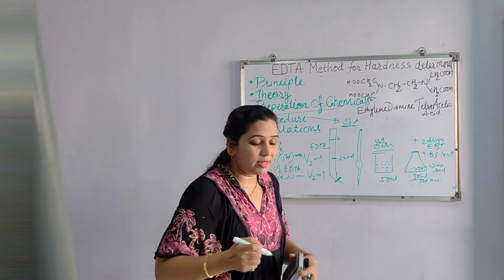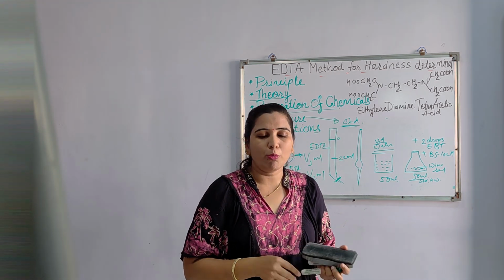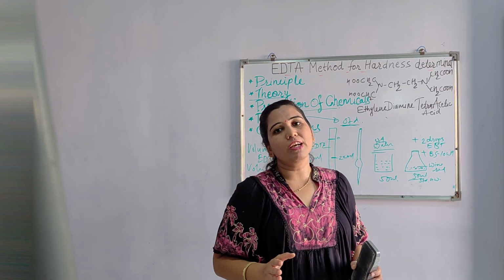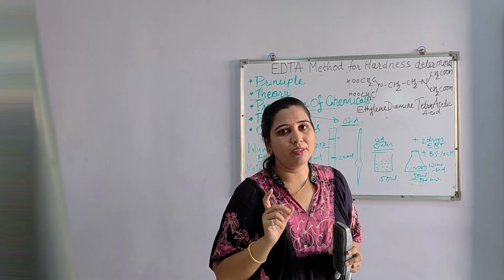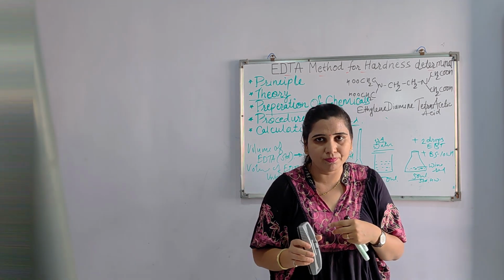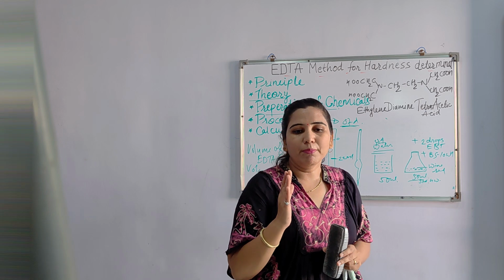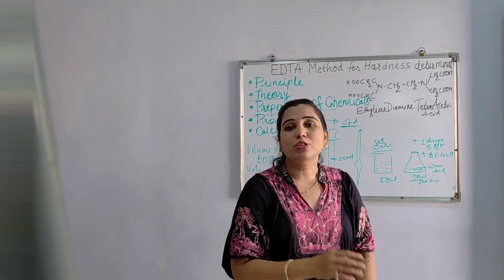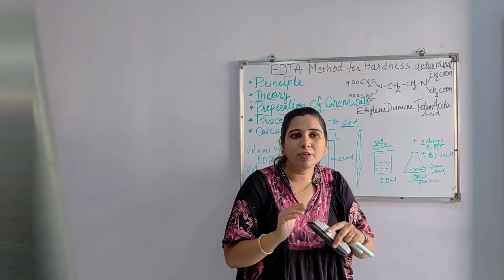Okay. Now during the third time there must be the use of boiled water sample. So there is one procedure for boiling also, which I will explain. At first we have to take a 500 ml beaker in which 250 ml of accurately measured unknown hard water, which was used, is taken. Then it is boiled at about 100 degrees Celsius, because that is the boiling point of water. It is to be boiled continuously for half an hour without putting any lid on it. In this way there will be evaporation.